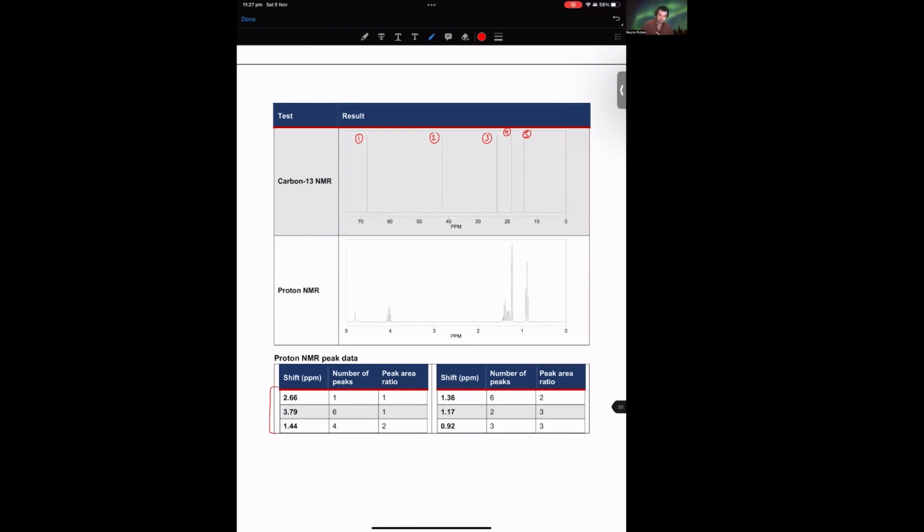Let's just say this is A, B, and then we'll say this is C, D, E, all clumped up in that weird space. And then we have F down here as a triplet. And in fact, I reckon E is specifically that one. There's a strong doublet there, which we'll come back to in a moment.